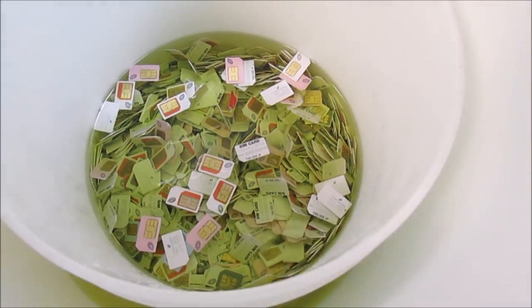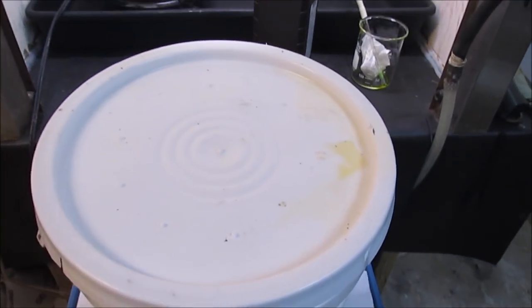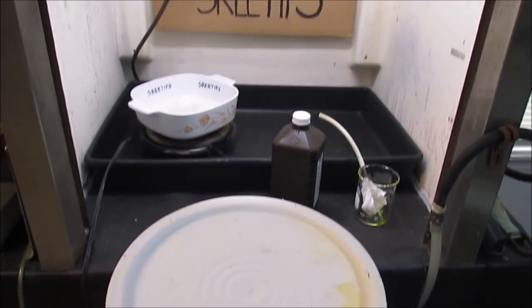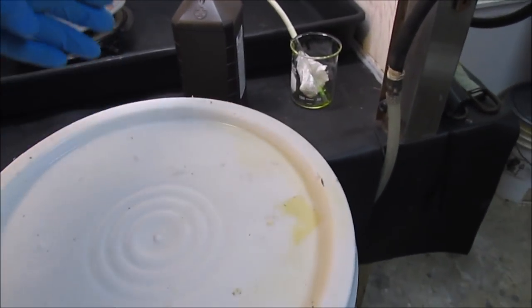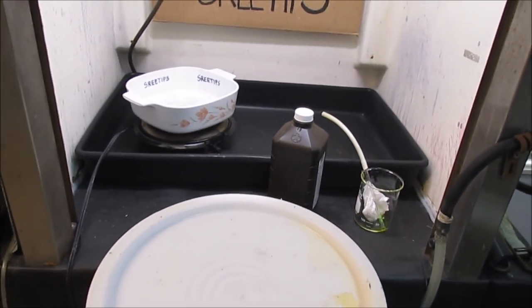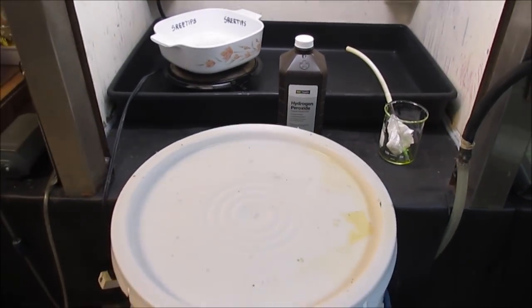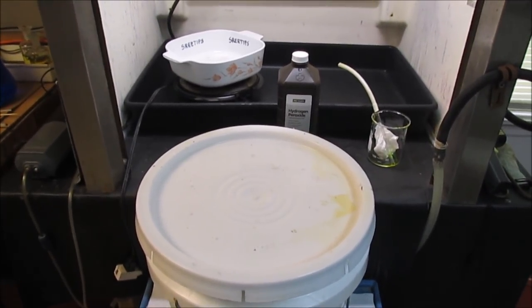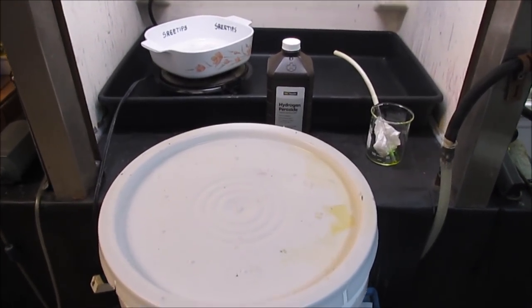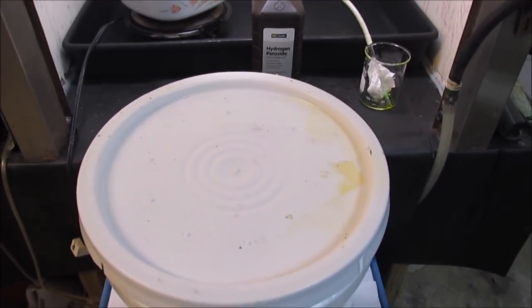Alrighty, I'm just gonna loosely cover this thing up, just so nothing falls in there. And remember, I'm working in a fume hood here, or the fume hood's drawing the vapors out. So you don't want to try to do this inside an enclosed area. You'll fill the room full of hydrochloric acid fumes and start gagging on them. The time right now is about 1:30. We just started the experiment, and we'll go from here.